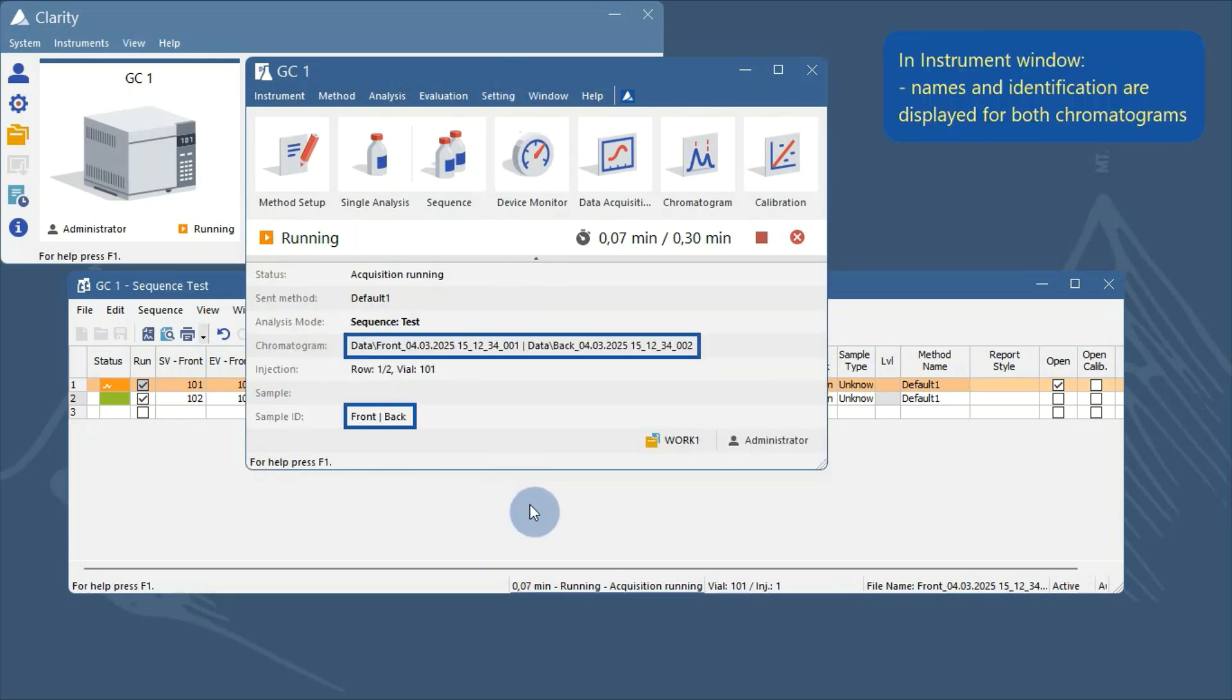The instrument window also adapts to display front and back position information side by side.